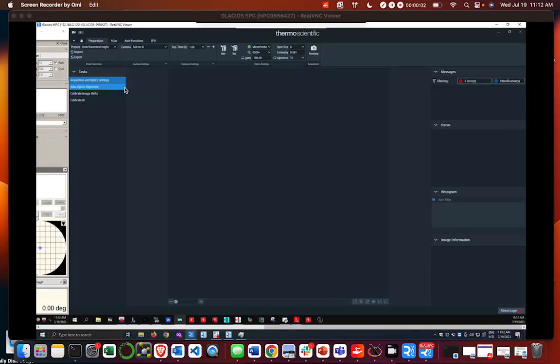Okay, so this is EPU, which is our data collection software, and it's designed for data collection. Because of that, the naming convention is kind of skewed in that direction. But this is what we'll use for screening, and the general layout of the software is as follows.